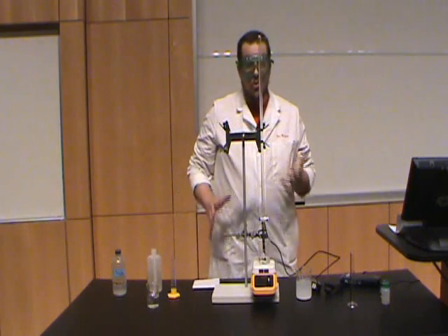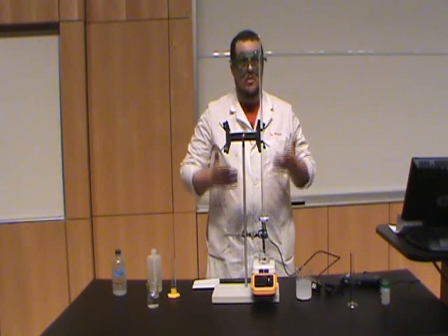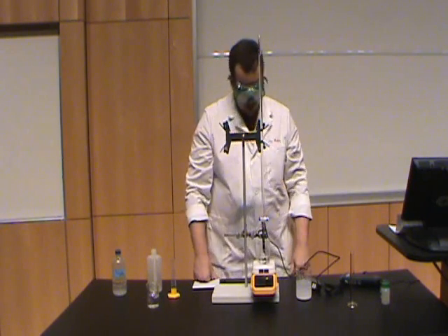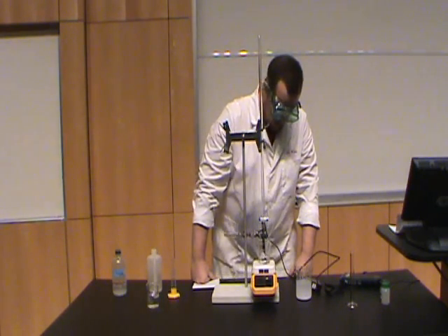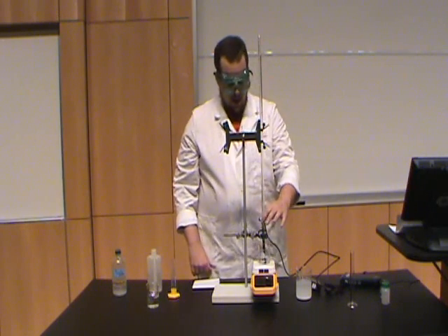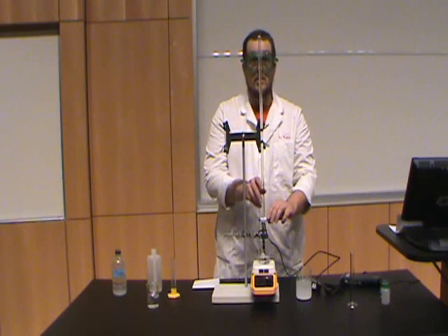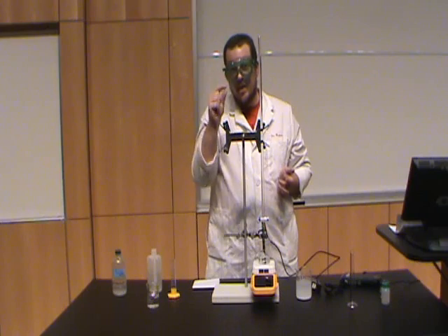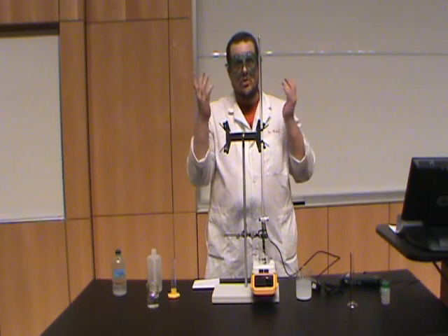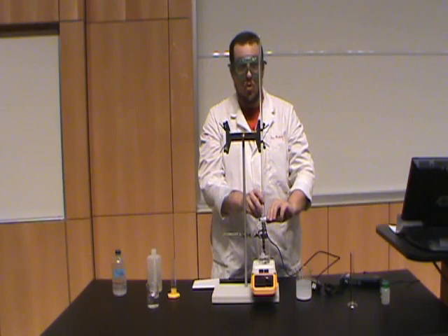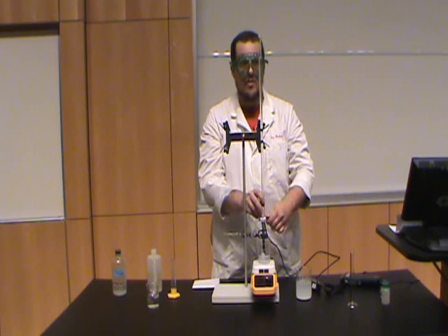So remember, when we're doing burettes, when we're using burettes, we take subtractive readings. So let's turn on the stir and get this thing mixing. Stir a little faster than that. And let's start to add. Now again, we want to add about a milliliter at a time, but don't waste time making it exactly a milliliter because that's just not that important. So let's add some.